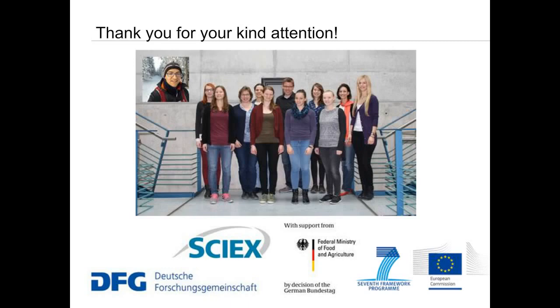How long does it take to do the peptide digestion? At the moment, we have presently in our study not yet really focused on speeding it up. So the general protocols which are around from the proteomics laboratories or the biochemical laboratories are often simply overnight, and to be honest, most of the time nobody really looked at how the efficiency is. We reduced this time to 4 to 6 hours, and using techniques such as the already mentioned microwave-assisted tryptic digest, and there are also other techniques around, it is in principle possible, and there are studies already published, that we can reduce the digestion time to something like 10 minutes, 15 minutes maybe. And then the sample prep would be pretty quick. So this is basically the idea, to speed up this specific part of sample preparation.